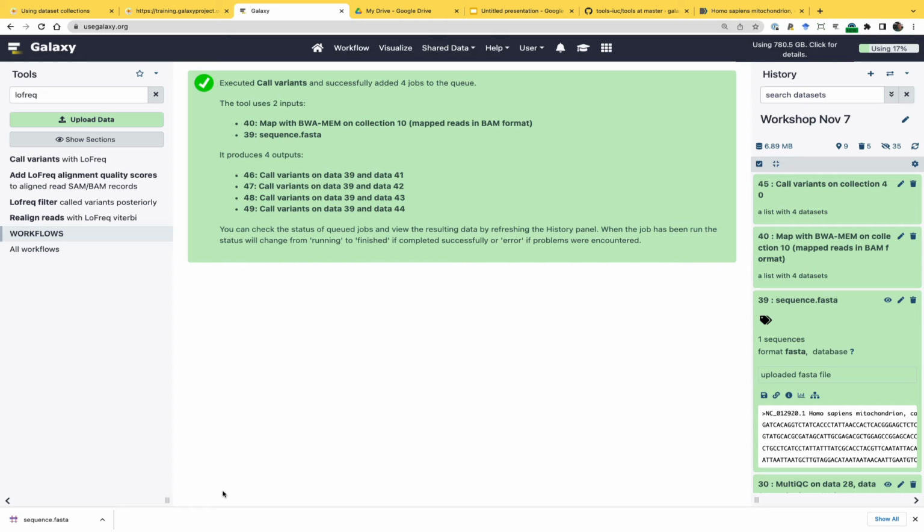and they have germline and somatic modes. And somatic mode is kind of similar to this scenario, because in somatic mode you have a bunch of cells, and most of them are reference, but some of them are mutated. For example, you have one cancerous cell in some constellation of cells. So they will also have these frequencies between 0 and 1.